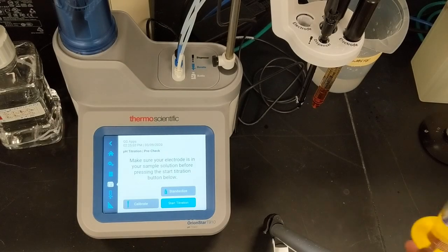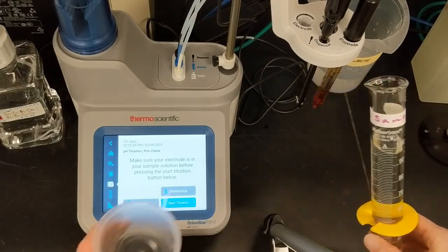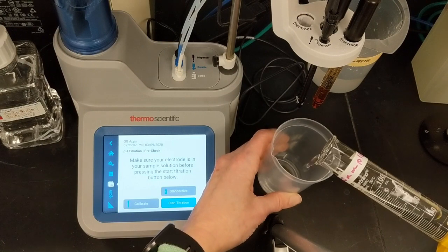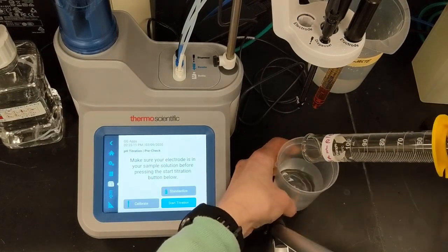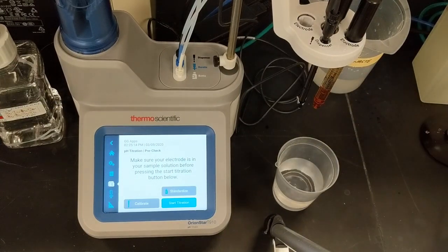To show the accuracy of the low-level alkalinity titration, I'll run a standard of known alkalinity. I measure 100 mL of the standard in a graduated cylinder and transfer to a clean beaker.